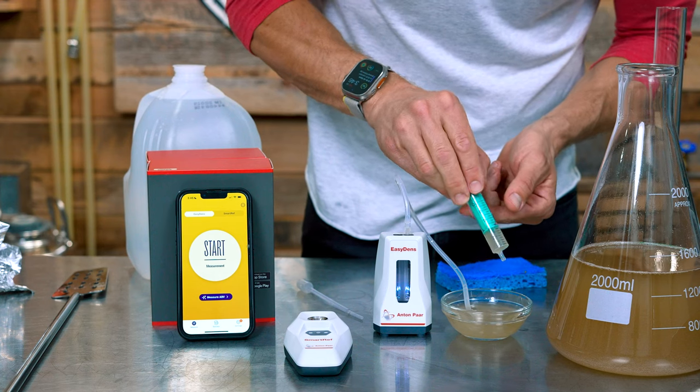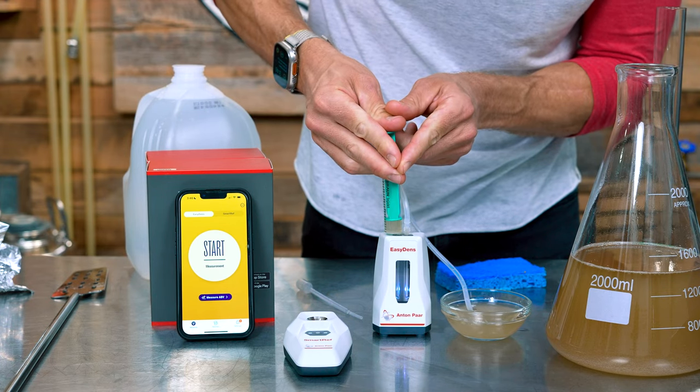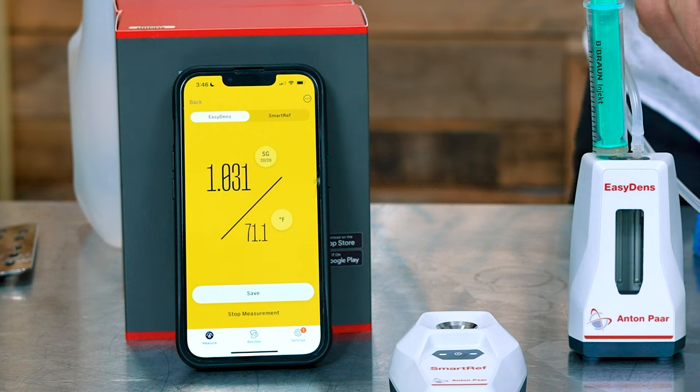To use it, take a small sample of wort, degas it with a syringe, and run it through the unit. It'll provide the temperature of the liquid and the temperature-corrected specific gravity in just a few seconds. To get the most accurate readings, the temperature of the sample should be somewhere between 40 and 86 degrees Fahrenheit. If you want to use different units, just get into the settings on the app and navigate to what you want. You can also save the reading so you don't even need to write anything down. We've been using the first version of the EasyDense for years and this one's even better. It's $400, but if you've got the money, I highly recommend you buy one. If not, I recommend adding this to your wish list because honestly, it is awesome.